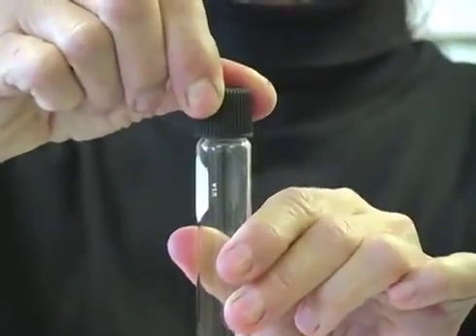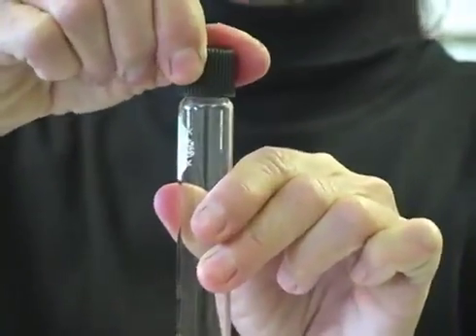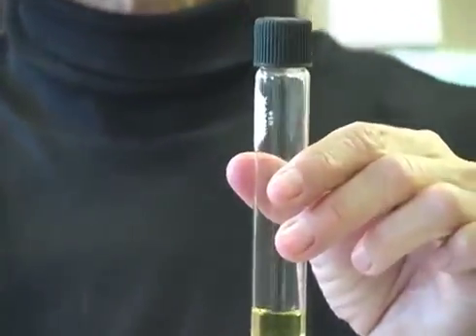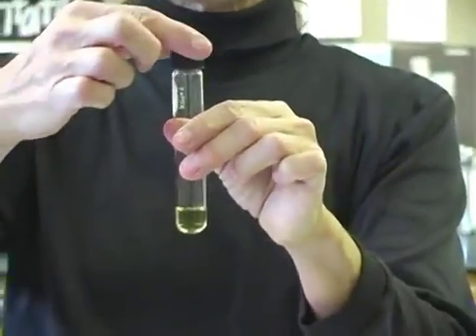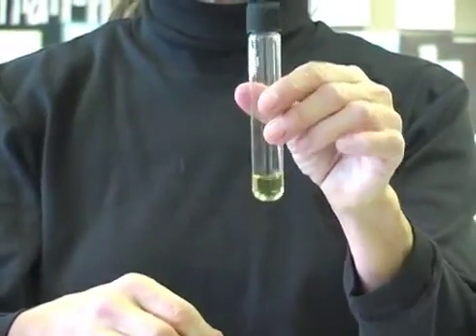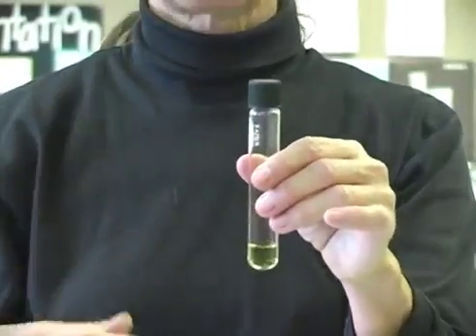in the kill area after we've used them, the cap is slightly loosened to permit venting of gases that accumulate during microbial growth. Without loosening the cap, pressure can build up inside the tube so that when we handle the tubes, they may explode into our hand.